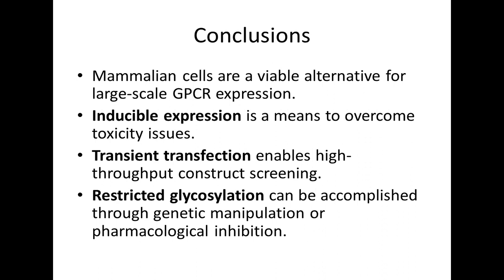And finally, some of the issues such as glycosylation and the issues it can bring up for structural biology can be avoided using either genetic manipulation or pharmacological inhibition. So that's the conclusion of what we had to present, and we're happy to open it up for questions now.